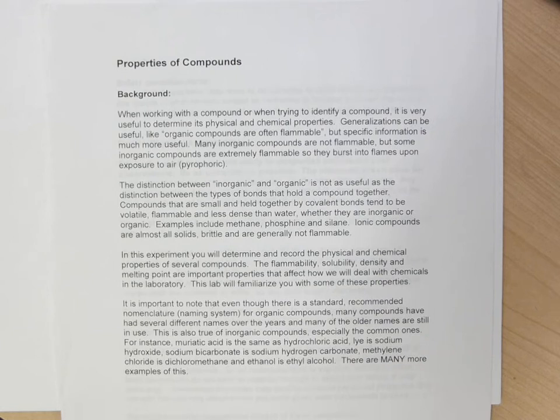Welcome to the virtual part of CHM230 Lab, the Introductory Organic Chemistry Lab. Typically the first lab we do is on the properties of compounds. If you're going to work with a compound, you're going to handle it, it's very important to know its properties. If you're going to try to extract it into a solvent, you need to know its solubility. If you might be heating with a flame, you need to know its flammability.